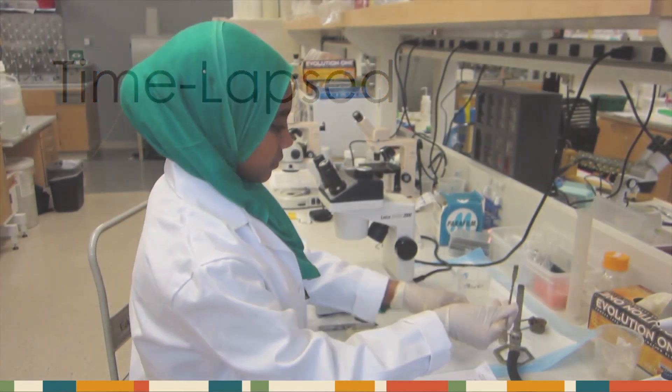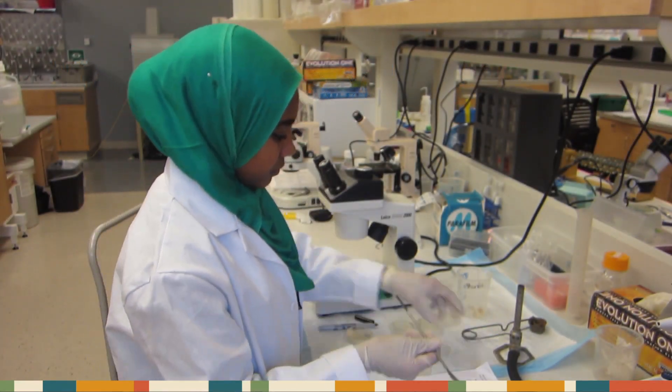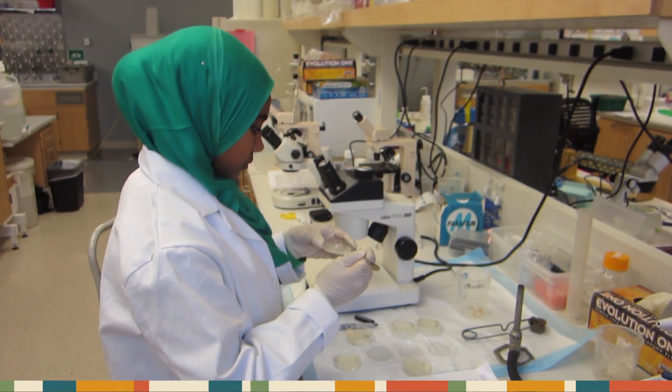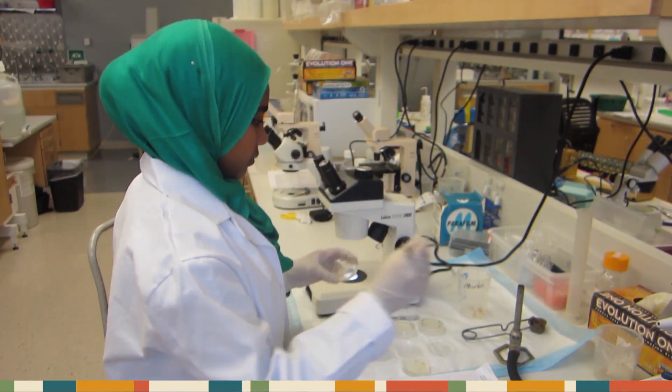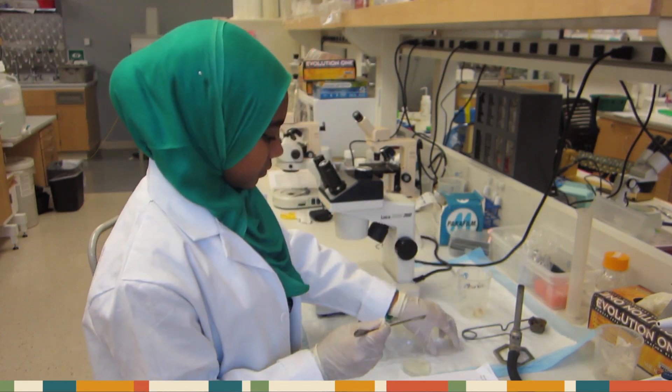After sterilizing your spatula, scoop up the second piece, and repeat the remaining steps for your high-salt plate. Remember to cover all your plates as soon as possible in order to minimize contamination.